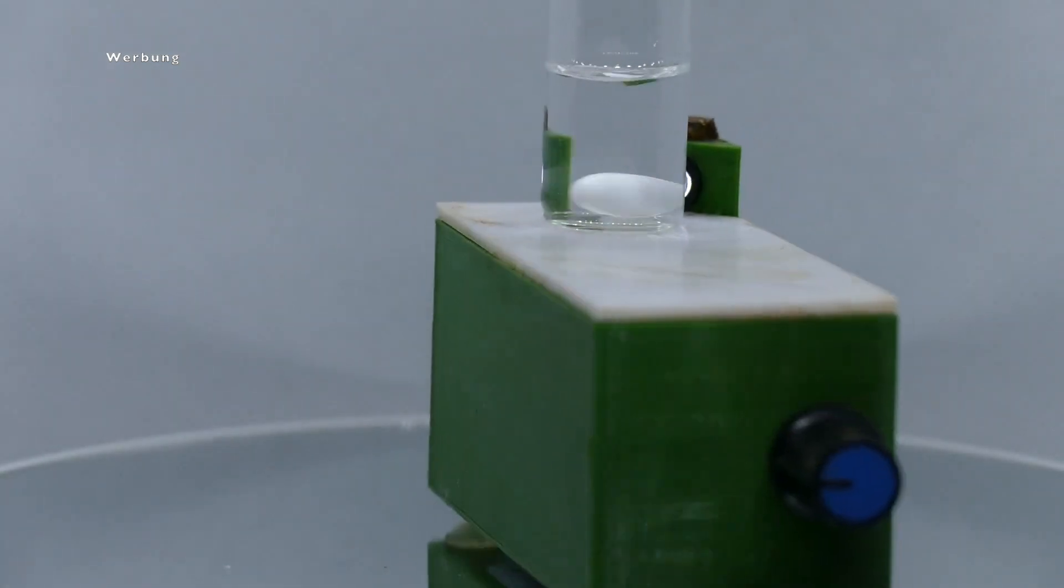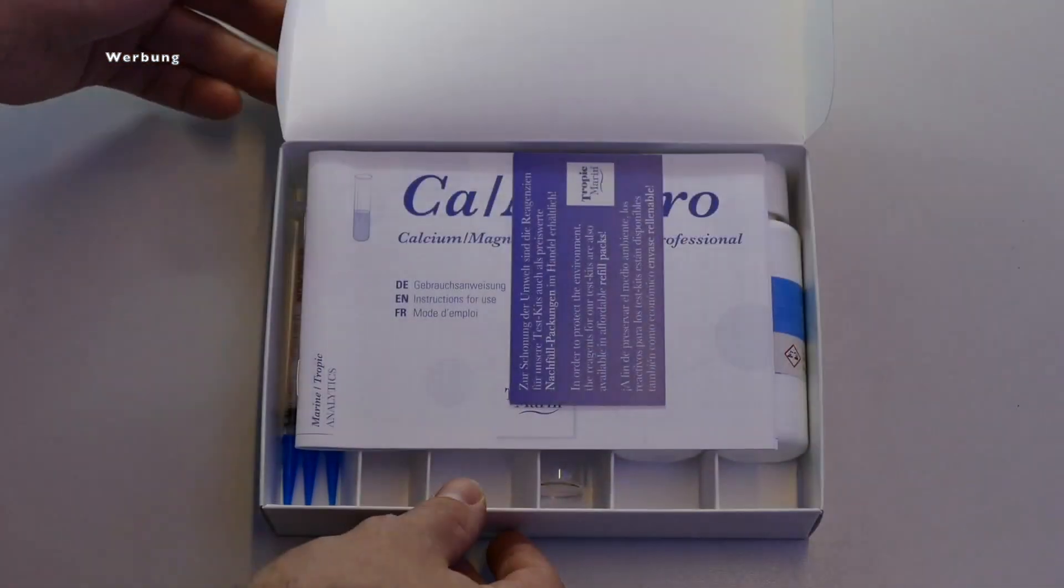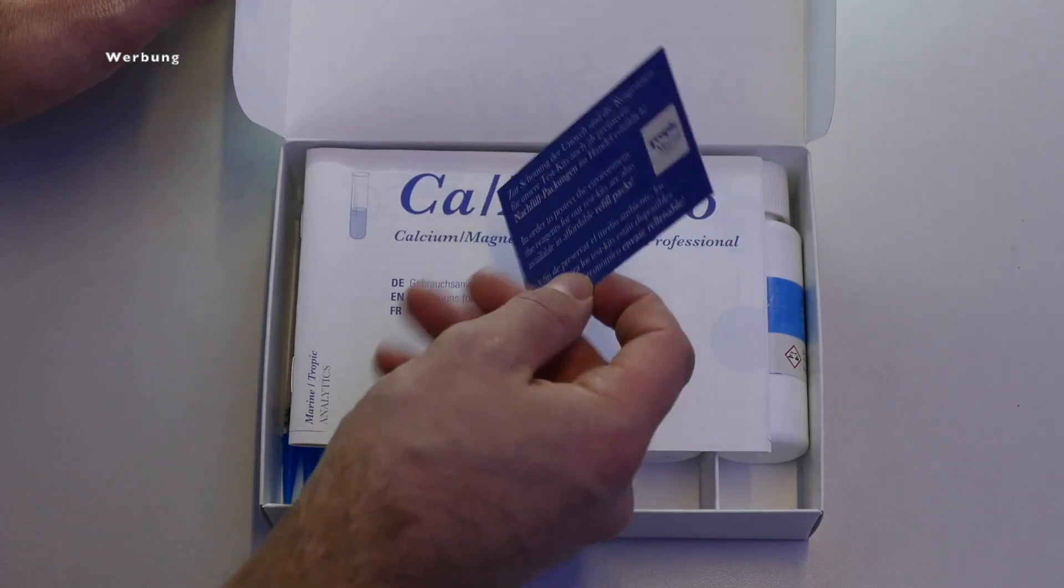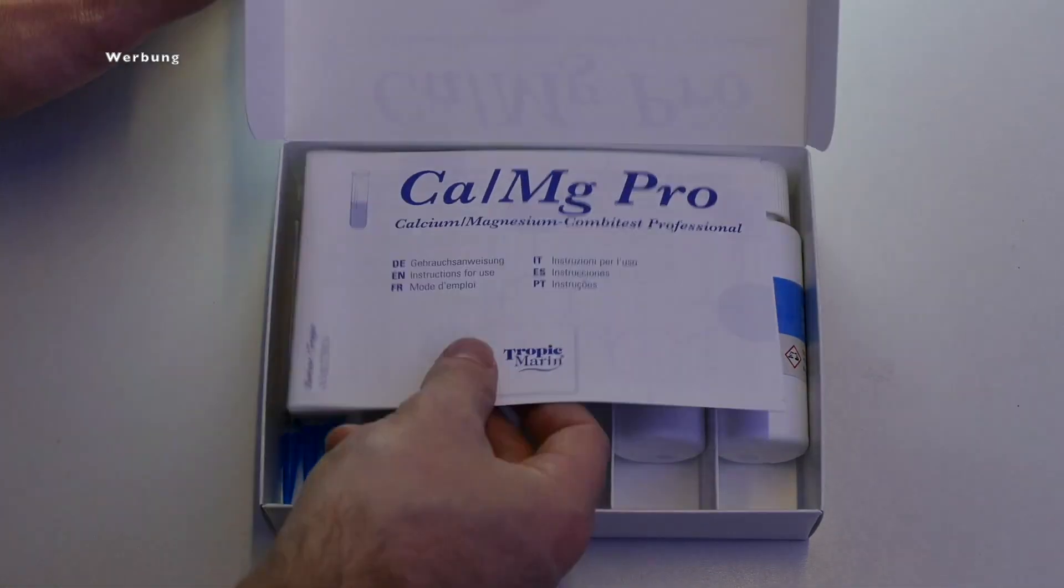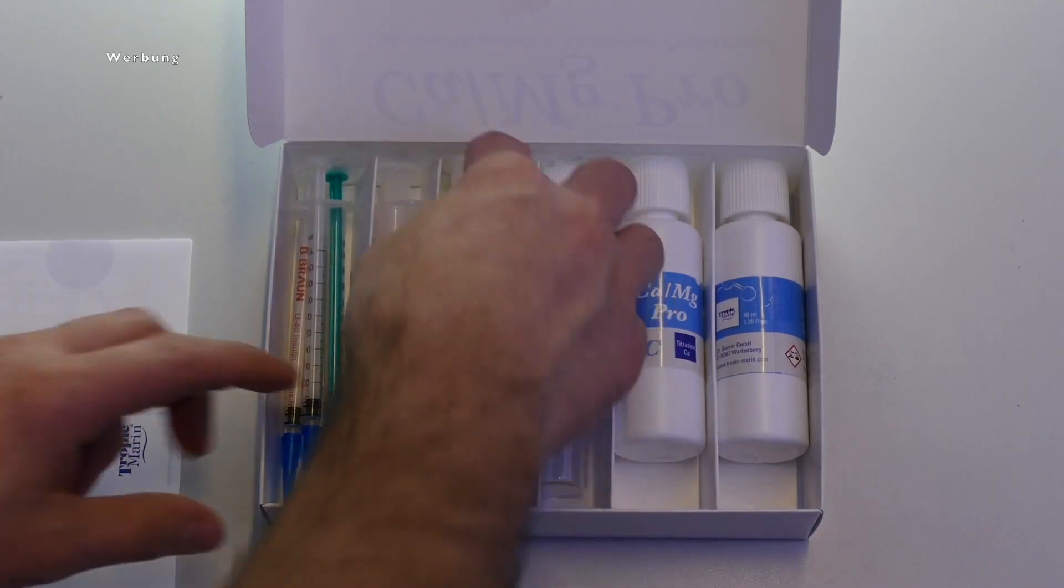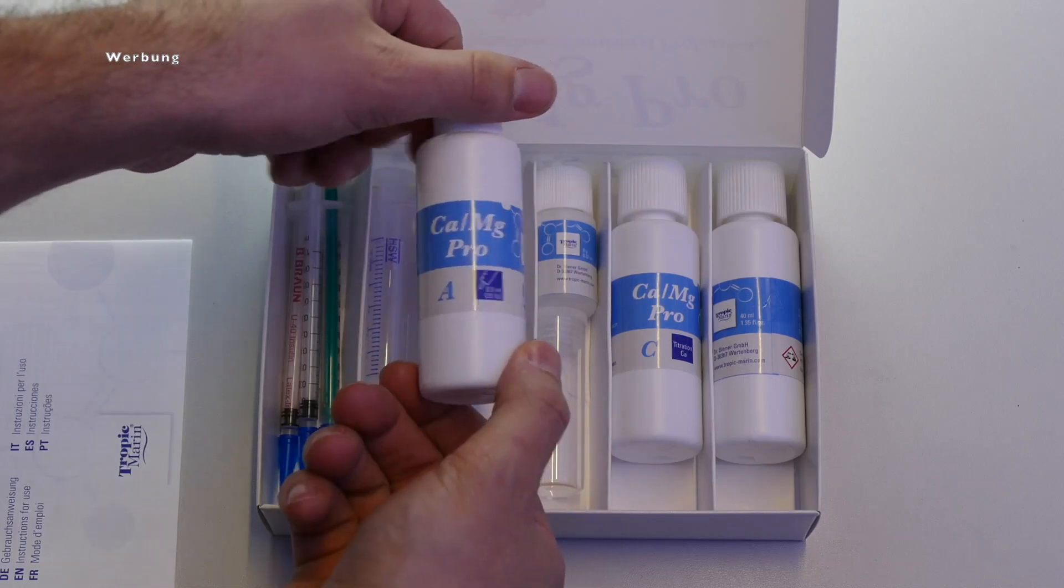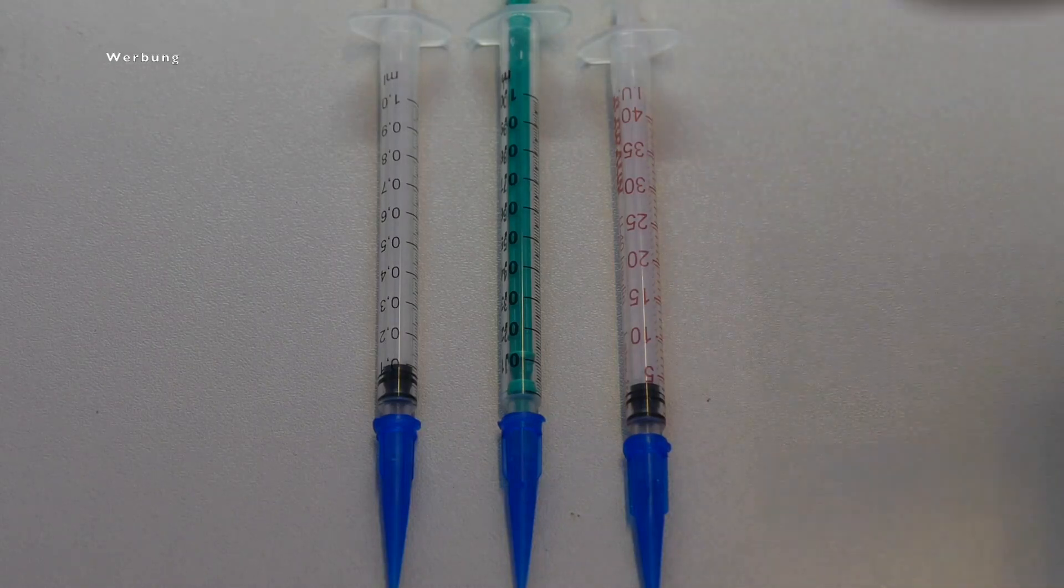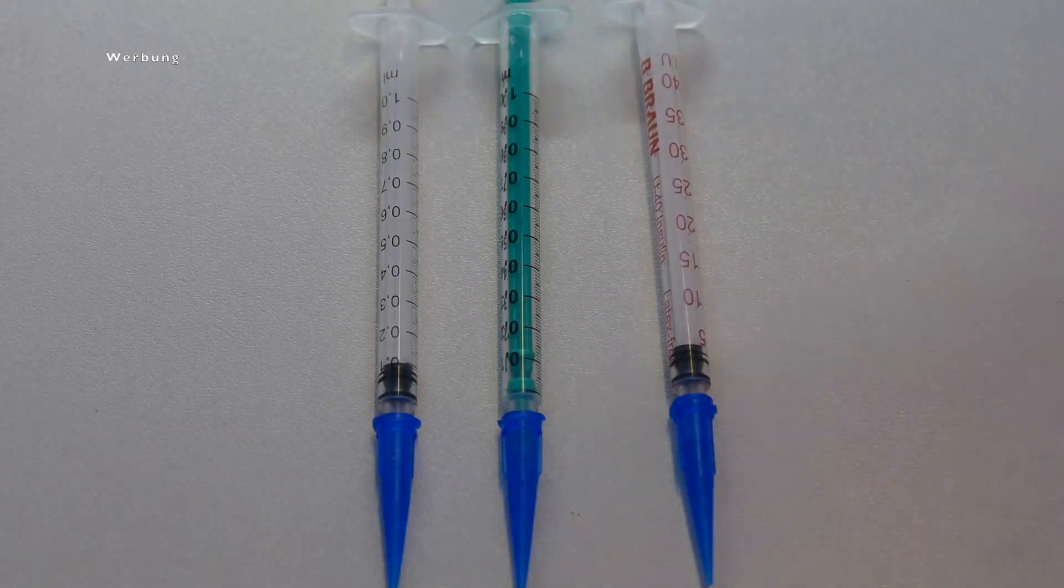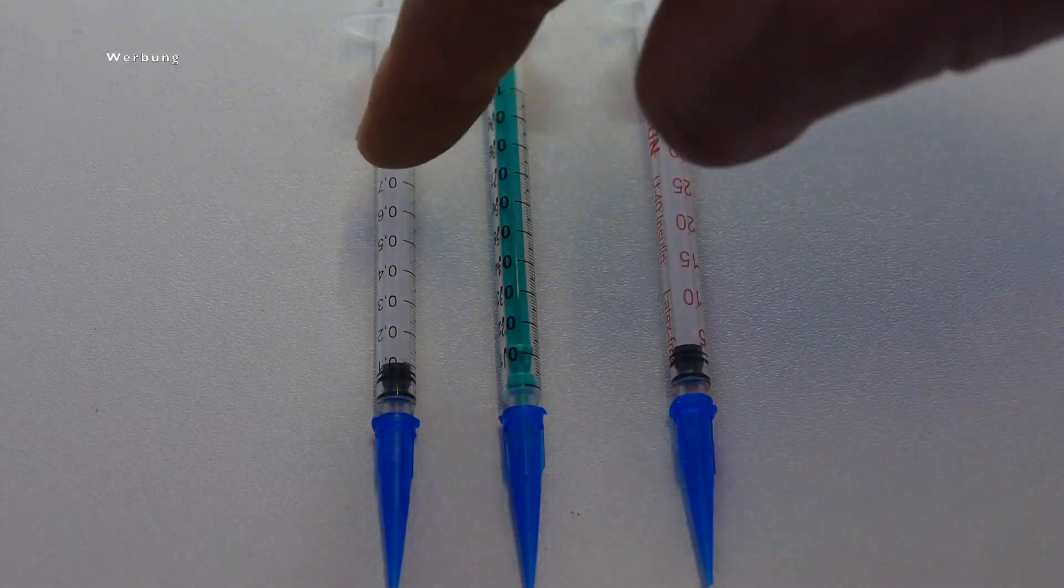Today's test kit is a little bit more involved than you are used to from water tests, because here you don't dose a given amount of reagent like in the usual tests, but some liquids are dosed until a color change takes place. The reagent that is then still in the syringe is used in order to determine the actual measuring result with the help of a table. Errors often occur here because the syringe is drawn up and read off incorrectly. We will therefore discuss this test in detail and discuss exactly where and how to read the results. So our main focus in these tests is on these three syringes. You will notice that an air bubble will appear in the syringe when you put the tip on. This is completely normal, and the air bubble does not need to be removed. In the small blue attachment tip, there is exactly the amount of liquid that corresponds to this small amount of air bubble. How exactly to read it, you can see immediately.